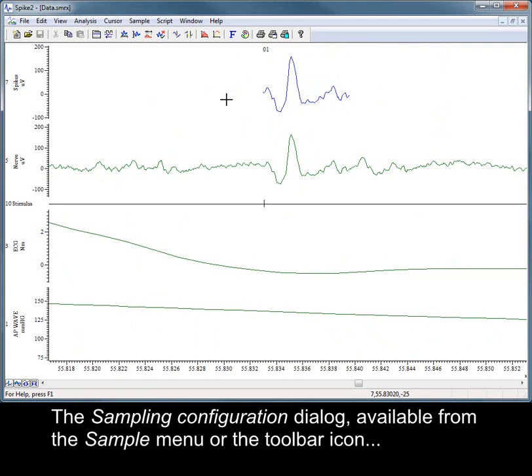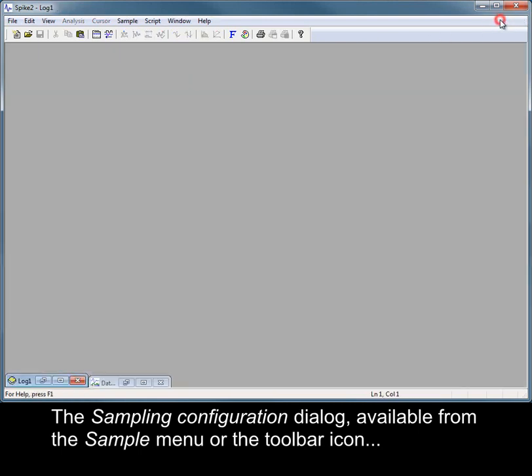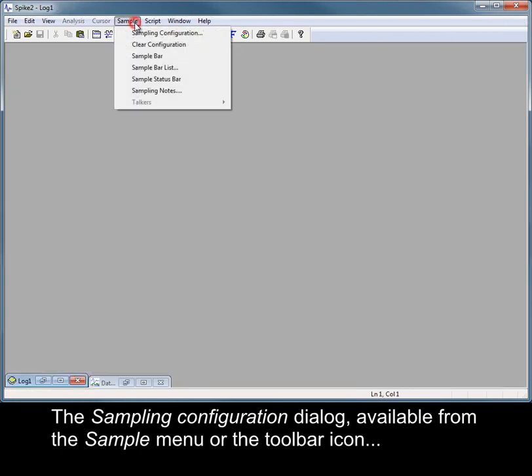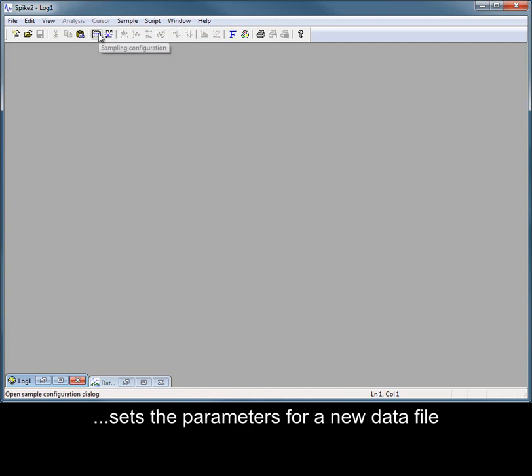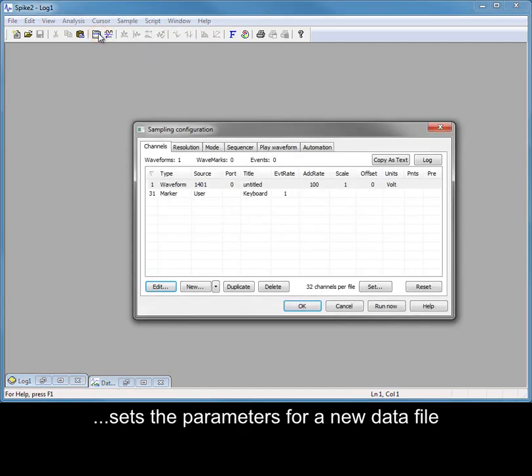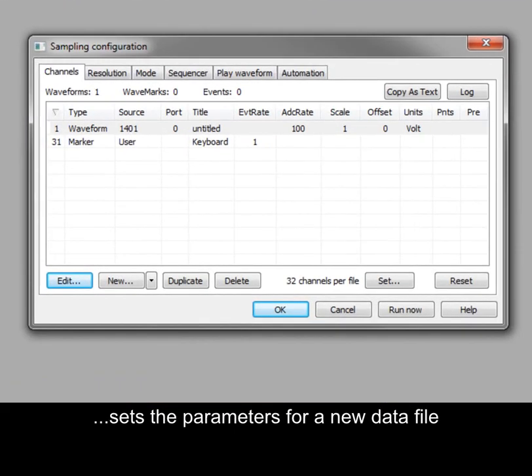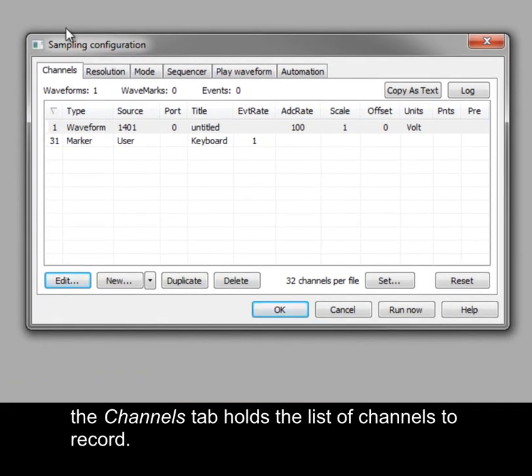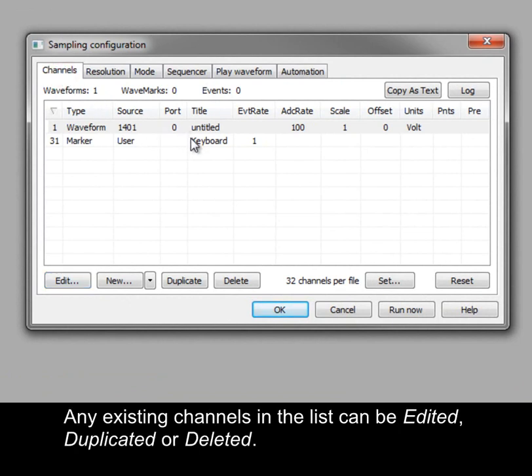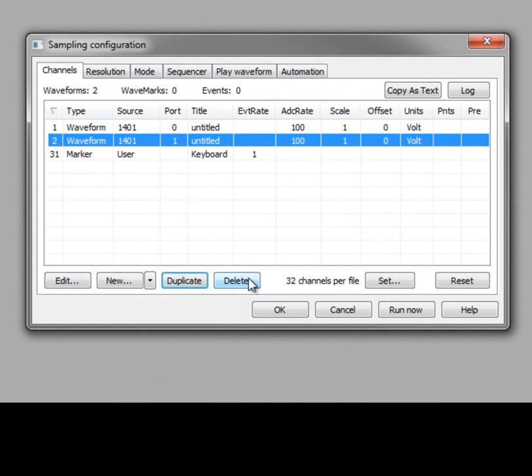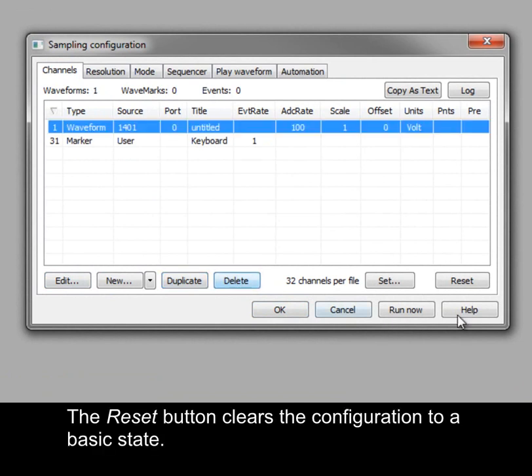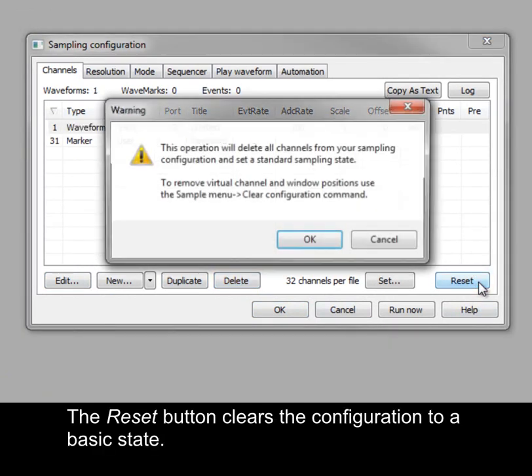The sampling configuration dialog, available from the sample menu or the toolbar icon, sets the parameters for a new data file. The channels tab holds the list of channels to record. Any existing channels in the list can be edited, duplicated or deleted. The reset button clears the configuration to a basic state.